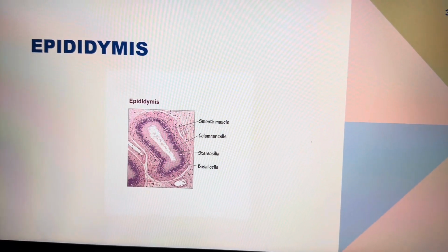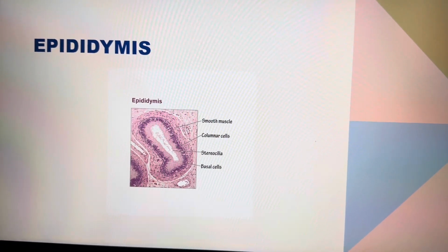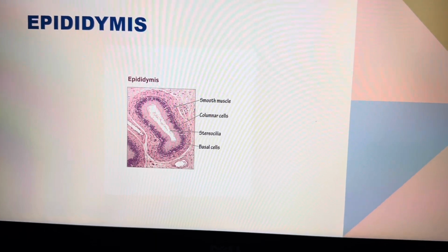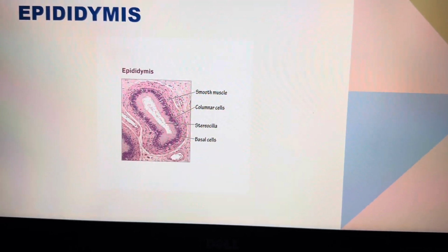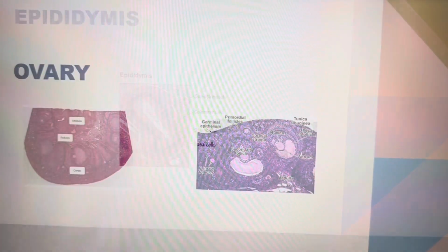Within the testes, we are going to find the epididymis. In this one, we need 2 different things. We need the sperm, and then to know the stereocilia. The stereocilia is going to be within the lumen of this here. It has cilia in it, so the best way to remember is the little hairs in there. So that would be my biggest advice for that.